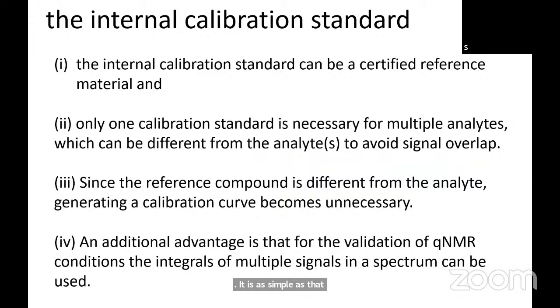So internal calibration standard is needed. It can be a certified reference material. So US FDA and other regulatory agencies have proposed a list of internal standards that can be used in qNMR. Okay, it does not stop you from doing research work. We ourselves are also working on using different internal standards, which can help us for the efficient analysis of samples.